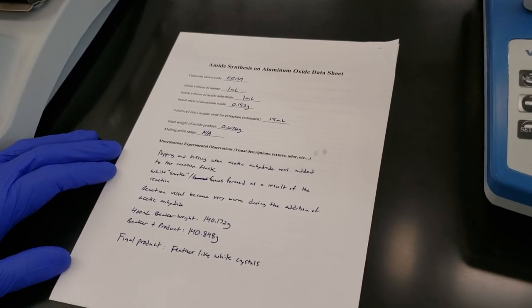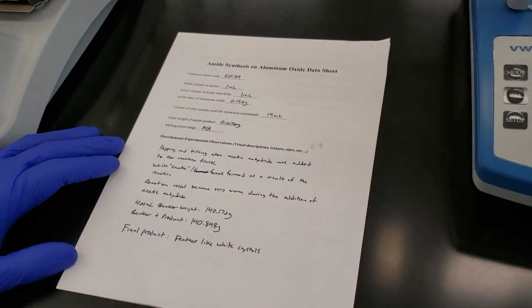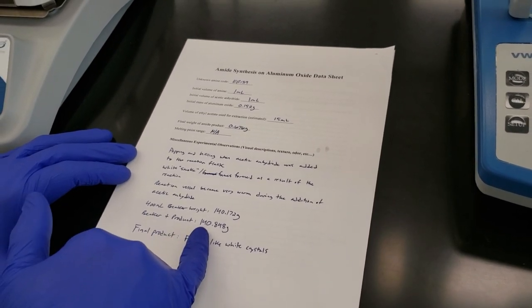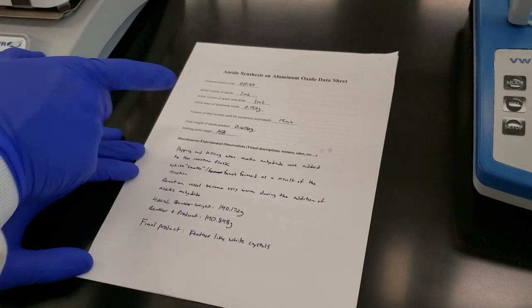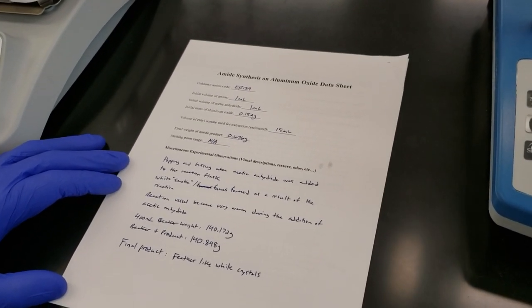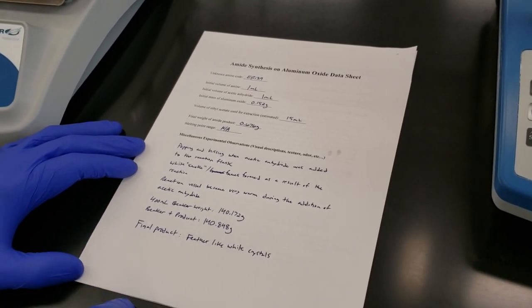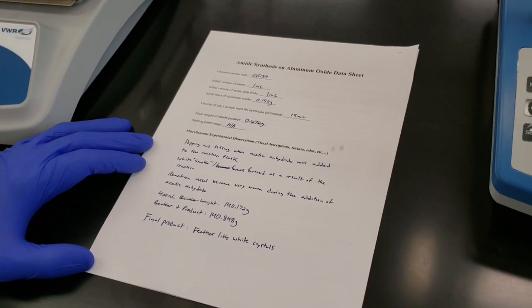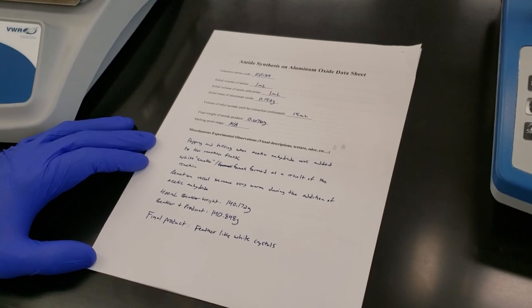Before we head over to our IR and NMR to characterize our final product, let's take one last look at our data sheet. We just weighed out our beaker plus our product at 140.848 grams. We subtract out the weight of our beaker. That leaves us with 0.676 grams of recovered unknown amide product. The appearance of our final product were feather-like white crystals. Let's go take a look at what our IR and our NMR spectra will tell us about its identity.